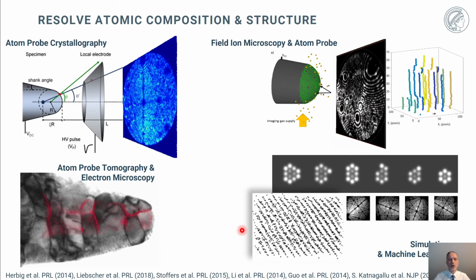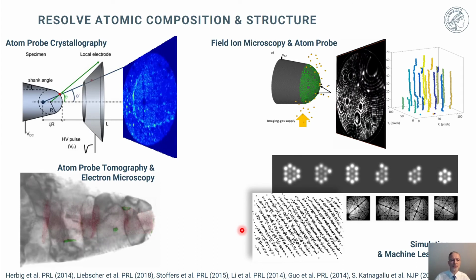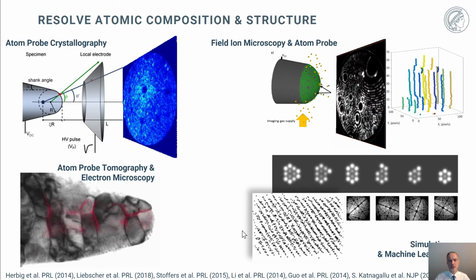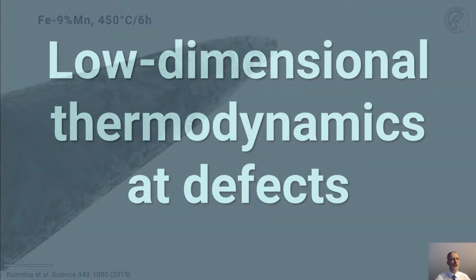And a currently emerging field is, of course, the machine learning and simulation enhanced analysis of STEM, of atom probe, and of field ion microscopy images. So let me show you a bit more detail about the low-dimensional thermodynamics at such lattice defects.